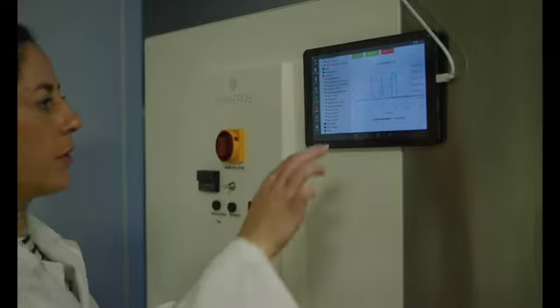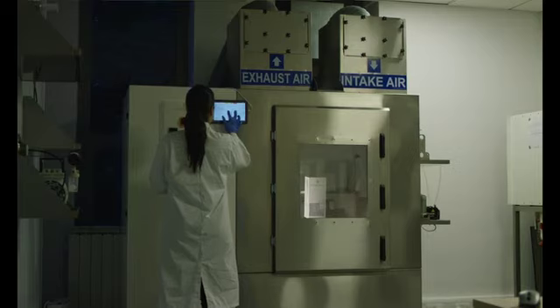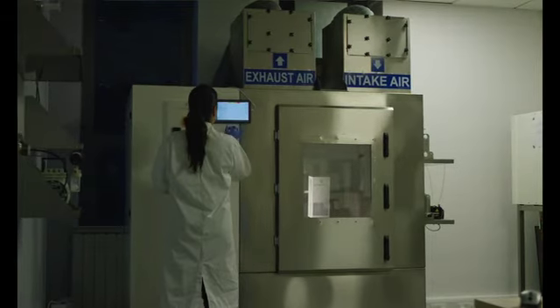The chambers that we use represent different sized rooms and the environment inside can be controlled such as the humidity, the temperature, and the air flow. The smaller chamber has been automated and allows a quick turnaround and sterilisation of the chamber to perform multiple tests.